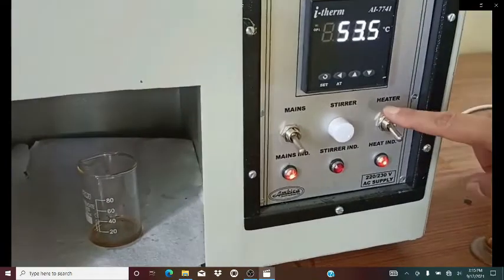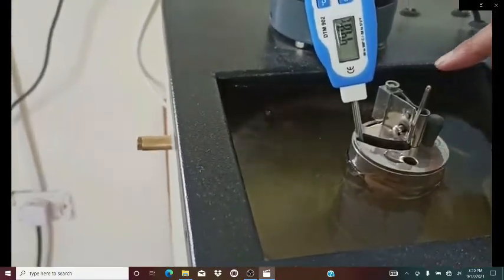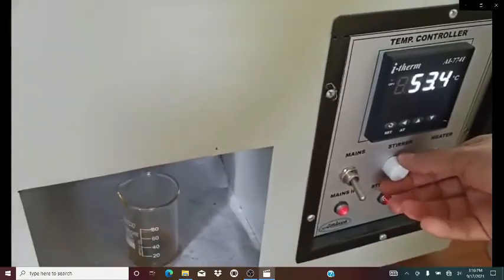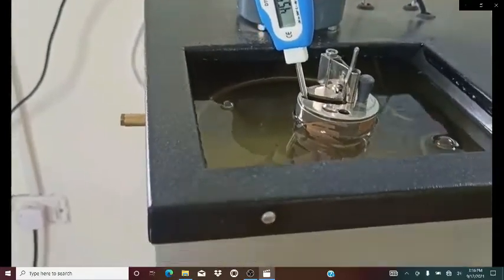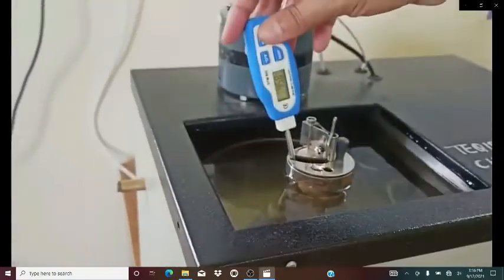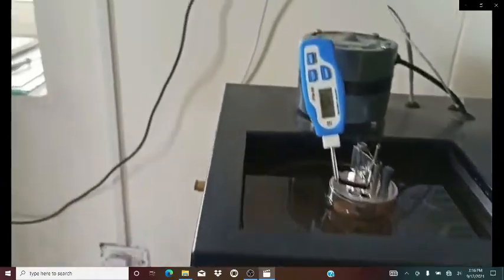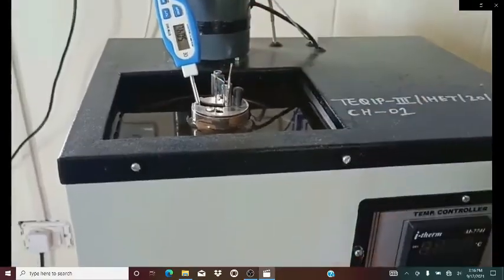Here is the mechanical stirrer. This stirrer is used for uniform heating so that all the water near the rod will disperse and provide uniformly heated water. Here you can see the temperature once it is maintained — 50.2 degrees. At this point we will start by uncovering the nozzle.